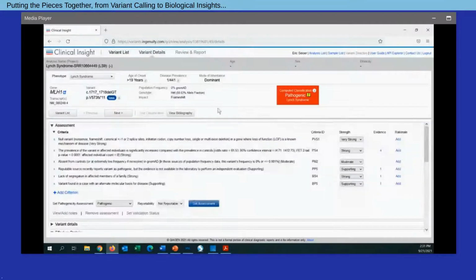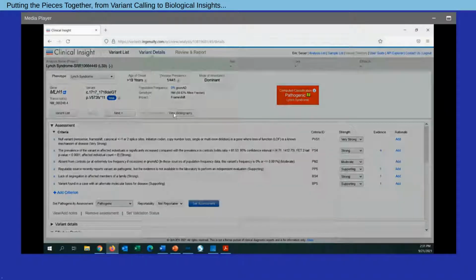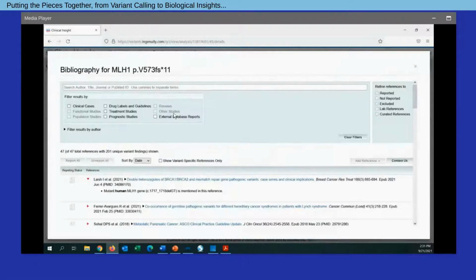Now, as I mentioned, the knowledge base also focuses on curating literature as well as incorporating third-party database information. So for any variant that we identify, we can actually get at the full spectrum of literature that's been captured in relation to this variant simply by clicking this View Bibliography button. What I want to highlight here very quickly is that we can filter the results based on different categories of studies of interest.